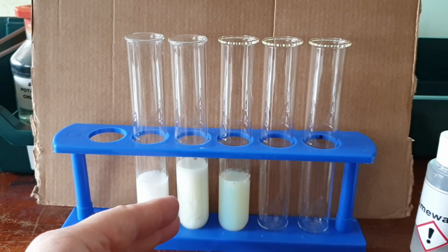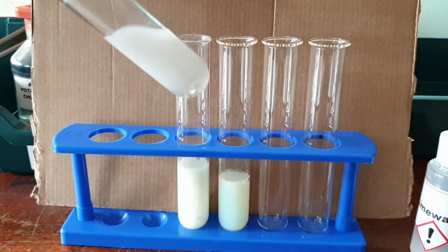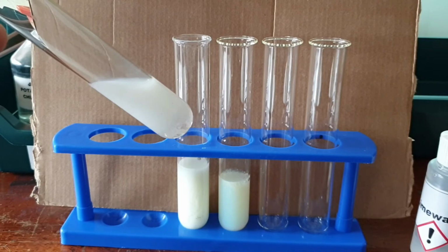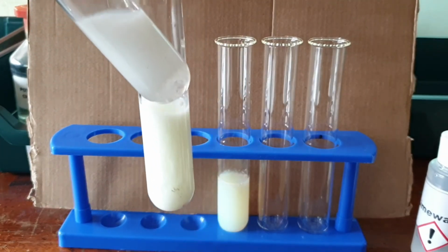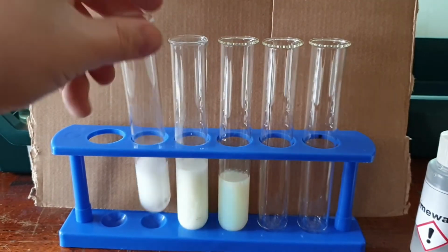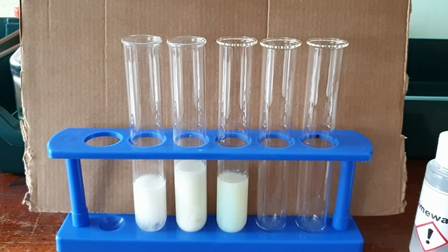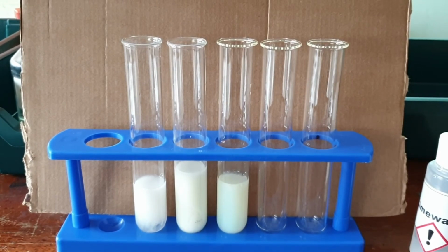White, cream, yellow. So as you go down the periodic table, chloride's the top one, underneath chloride is bromide, and underneath bromide is iodide. So it goes white, cream, yellow as you go down. But it's the same tests for all of them.